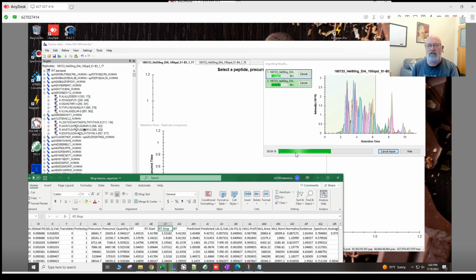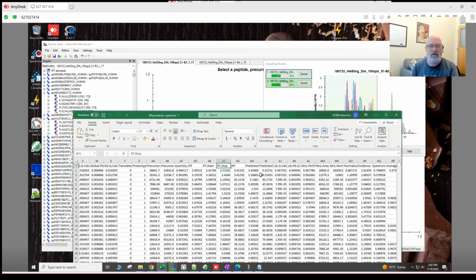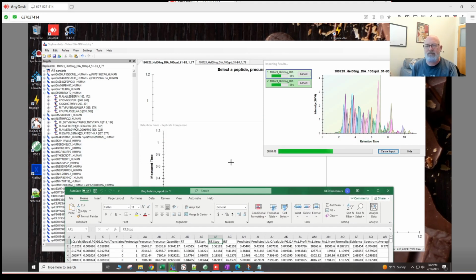Okay. Let's see. Come on. I think I actually have one that's open, but I don't think I imported the results yet, so let's just wait. Feel free to fast forward. I don't know how to actually pause it on Open Broadcaster. It just says start and stop, but it would be nice if there was a, let's see. Okay, almost done.